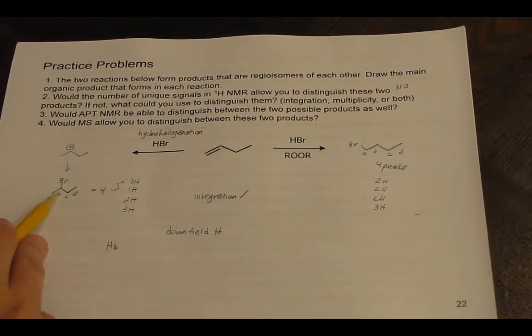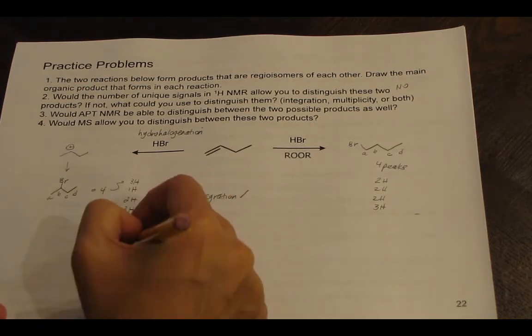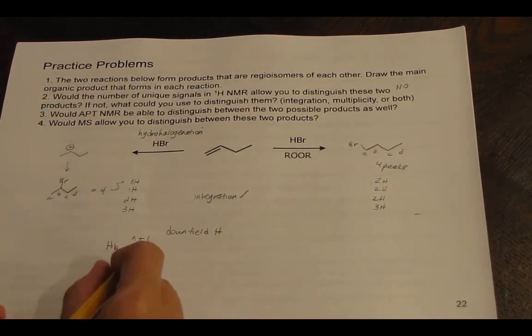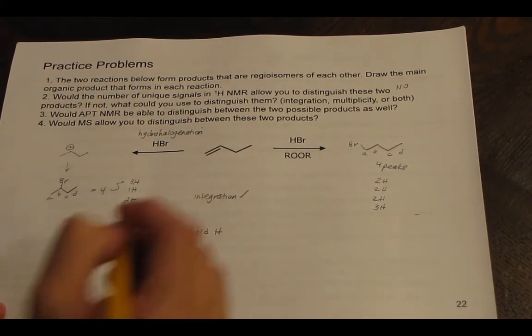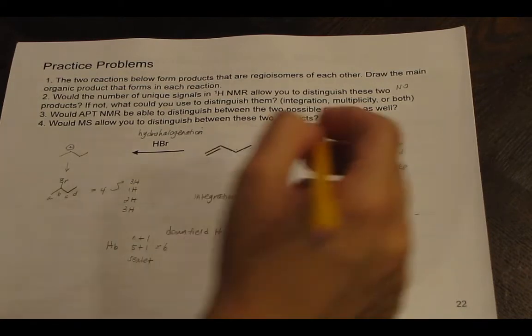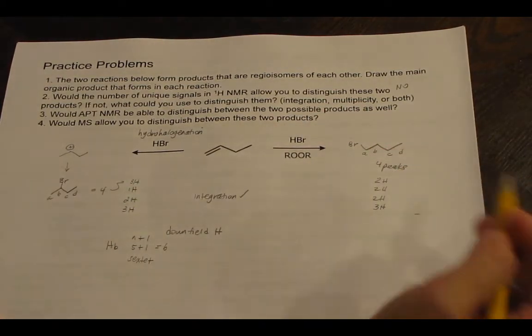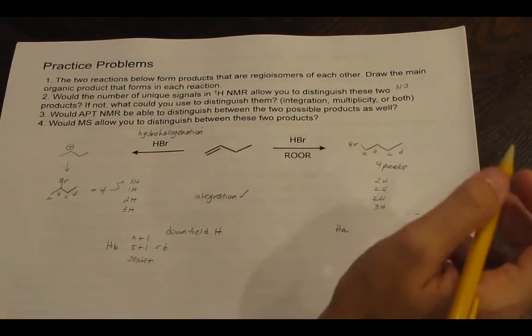And so HB, what would be the multiplicity? You count the neighbors, so it has 3 A neighbors and 2 C, so that's 5. With the n plus 1 rule, you have 5 neighbors plus 1 is 6, which is a sextet. That means HB would be 6 lines for a sextet. If we look over here, the most downfield hydrogen would be HA because it's connected to bromine.